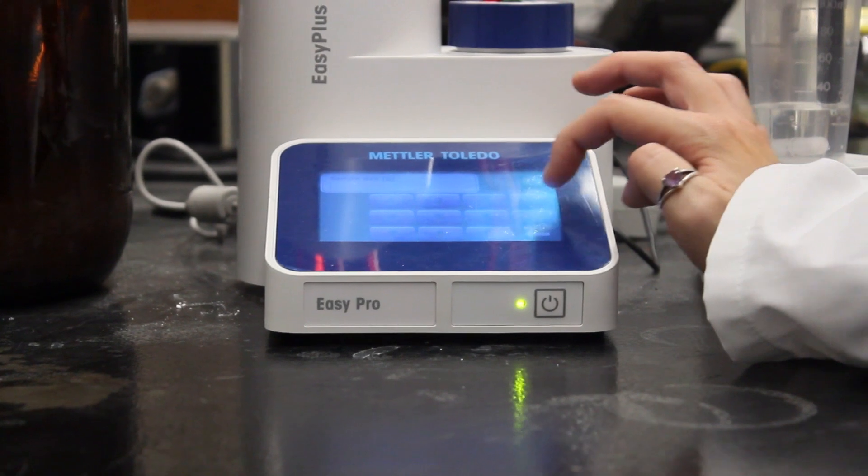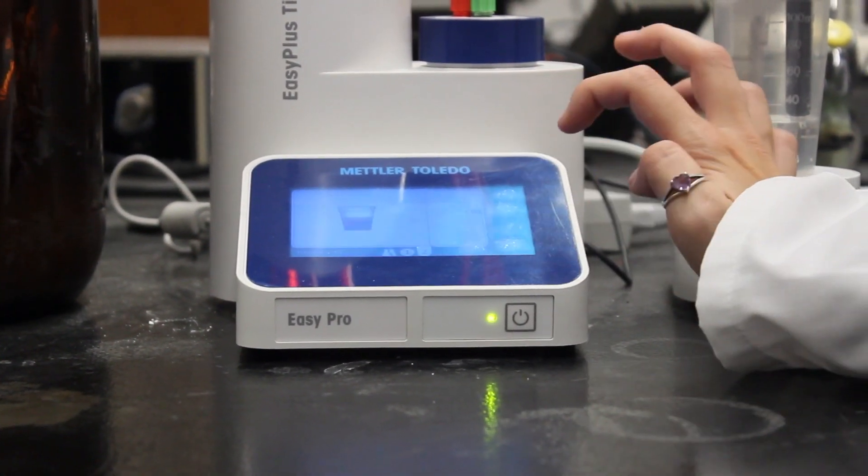Some equipment, like the auto titrator, is both crucial and as easy to use as pressing a button.